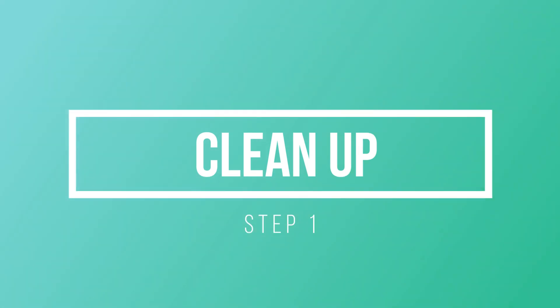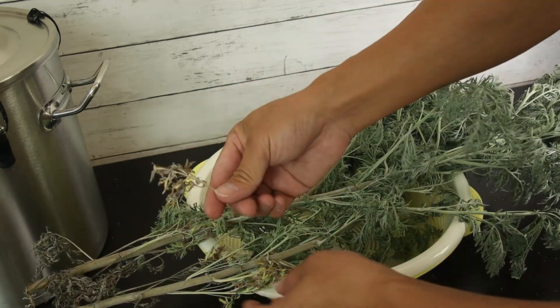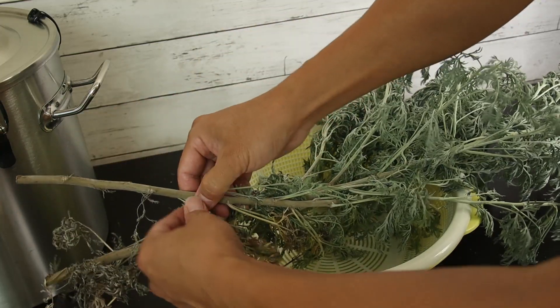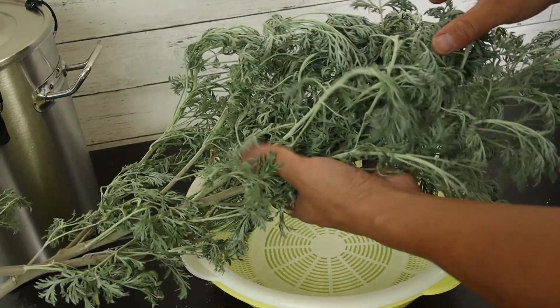Now I'm going to demonstrate the distillation of wormwood from its fresh herbs. There are several key steps you want to take to improve your extraction efficiency. Step one: after you collect the herb, clean up the wilted leaves and dried leaves, and just take them off.